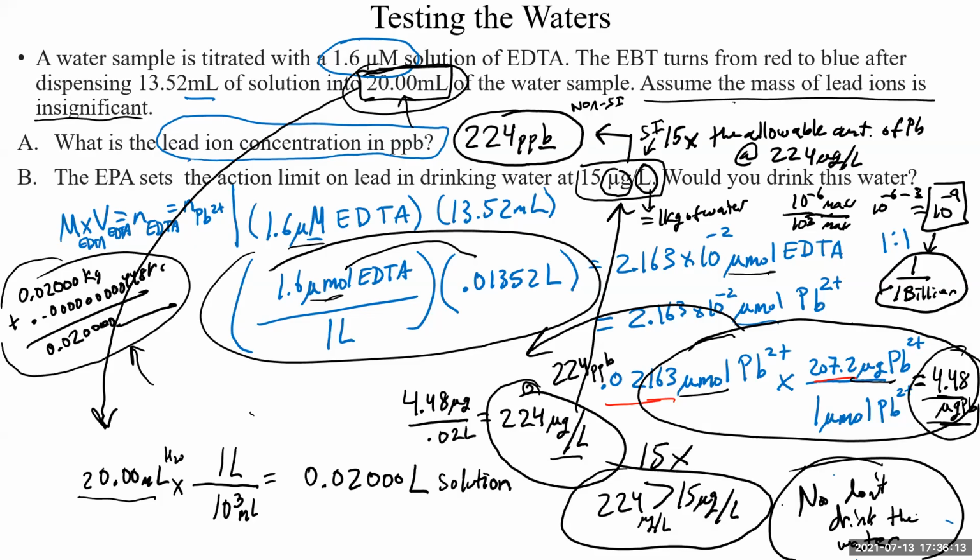There are actually electrochemical methods that can tell you when you've reached a certain threshold of concentration of ions. As you know, electrolyte solutions conduct electrical current. So you know you have no more ions when the current stops, or when the current decreases below a certain threshold, you know you've reached a certain limit of reducing the amount of ions in your solution. So there are electrochemical ways of determining concentrations as well.